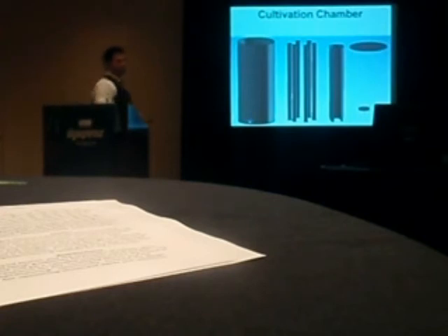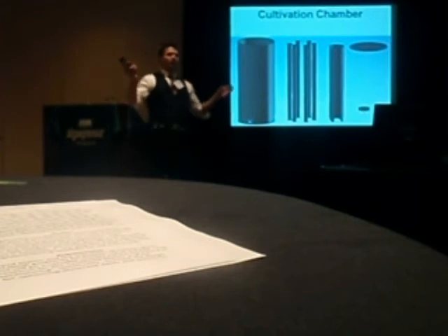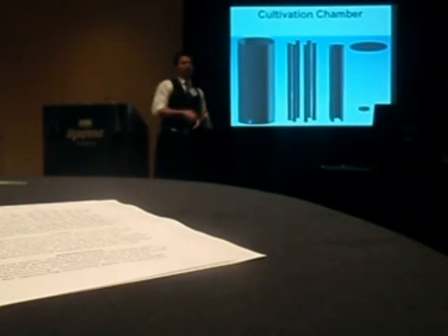And then what you have to consider is the number of light columns you want to get your light penetration depth optimized. And 6 was found to be cost prohibitive compared to 4.